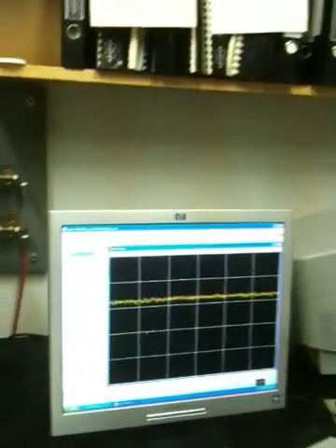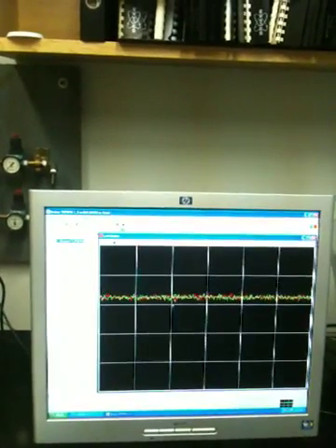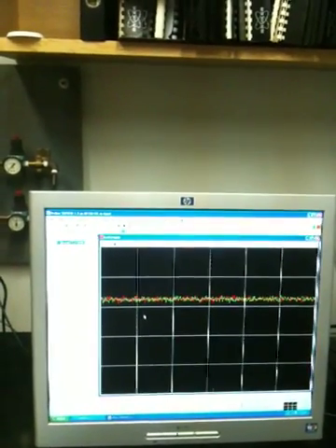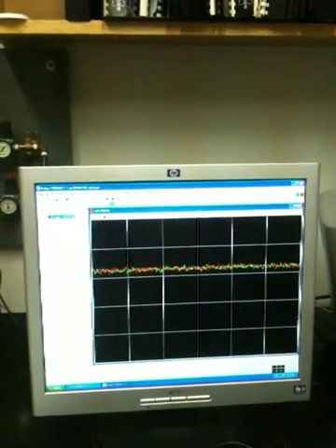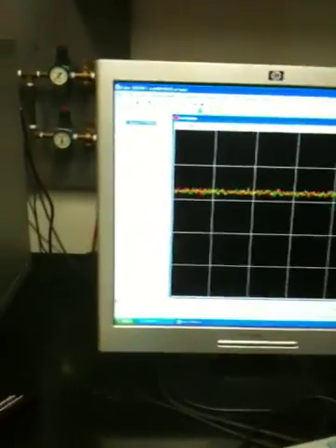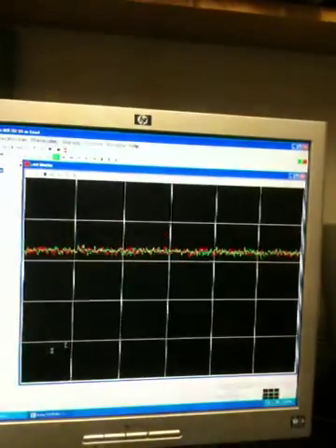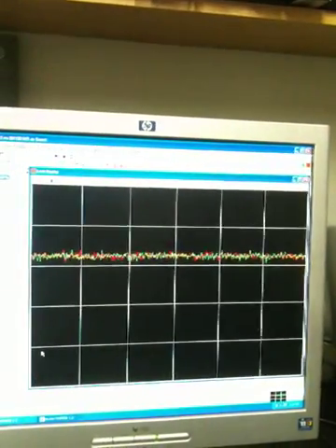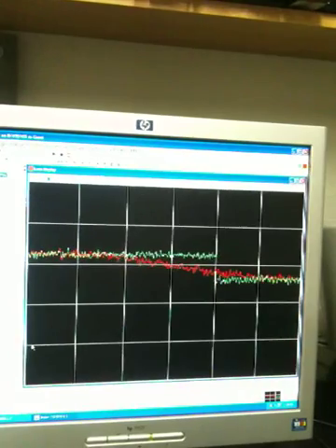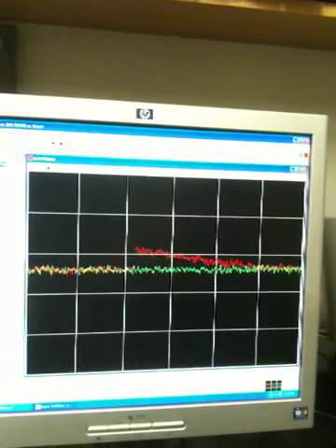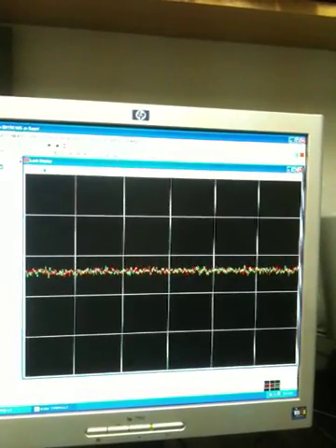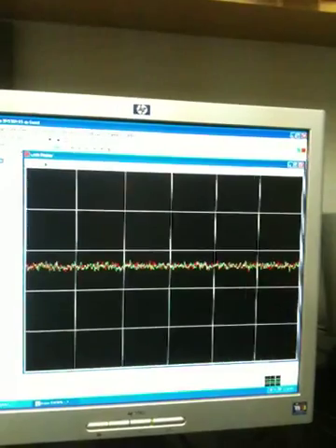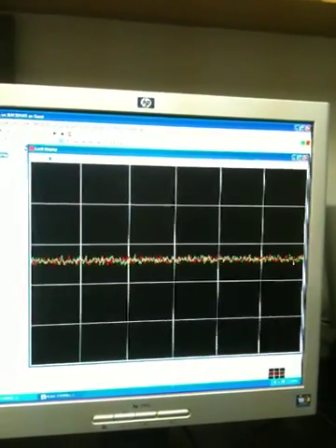Okay, now, what I need to do is improve this signal. So I'm going to type RSH. RSH means read the shims, and I'm going to explain what shims are in a second. So I'm going to click read. This signal may move when I do this. You'll notice it's moving down. That means it's actually getting worse. So I have to tune it up a little bit.